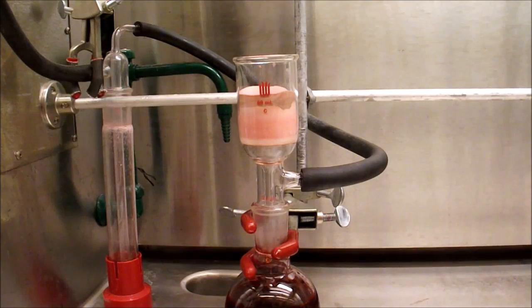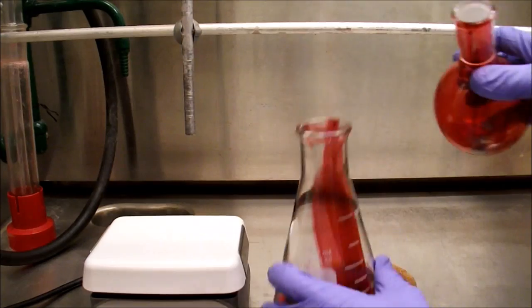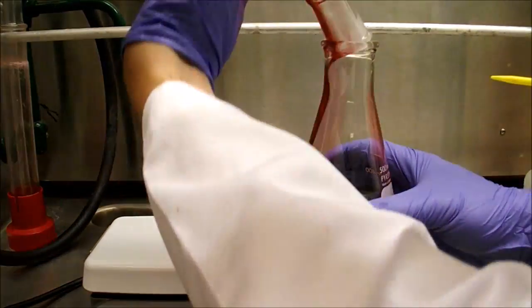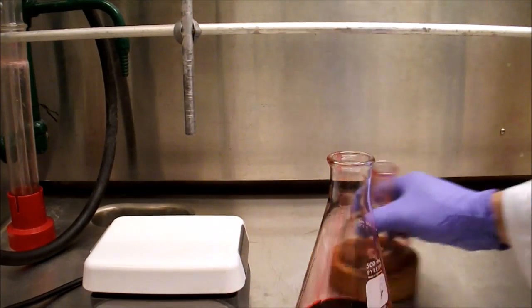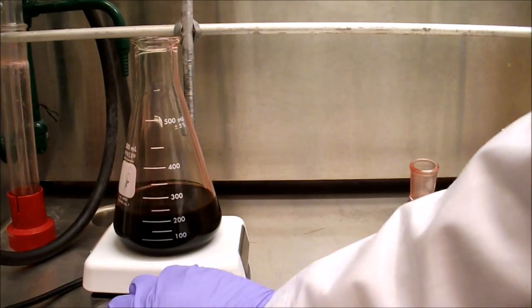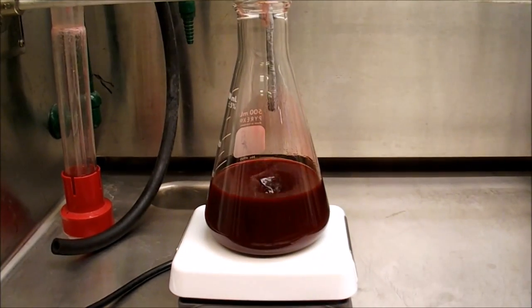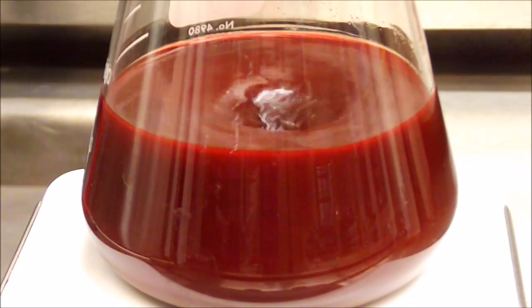The solvent is once again removed on the rotavap. Since this is the final compound in the series, purity is extremely important, and to achieve high purity we will recrystallize the product. The product is taken up in isopropanol and transferred to a large Erlenmeyer flask, with more isopropanol added to a total of about 250 milliliters. The mixture is then boiled and stirred until crystals form, monitored by watching for the solution to lighten in colour and for a light precipitate to form. In this case the crystallization took about 2 hours at a full boil.